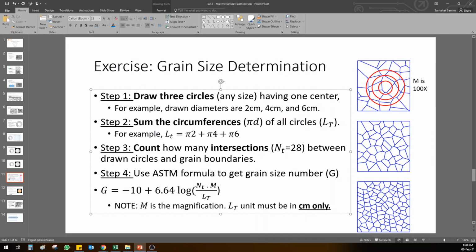Remember, yes, I agree that counting the points is also human judgment, and this can have an error here. But there is a trade-off in both methods. So the number of points intersecting the grain boundaries is the number you have to find.